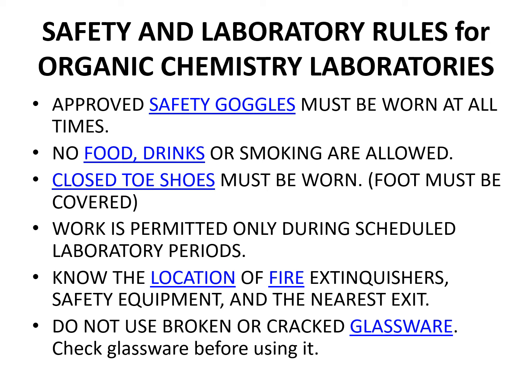Also, you cannot bring any food or drink inside a lab. Of course, no smoking, not even allowed on campus. In terms of apparel, you have to have closed-toed shoes and no canvas shoes, because chemical spills can easily go right through those to your foot, and that's not good. You can only work in a lab when it is scheduled and permitted and there's a TA present. You can't go in on your own, or when you're not allowed to.